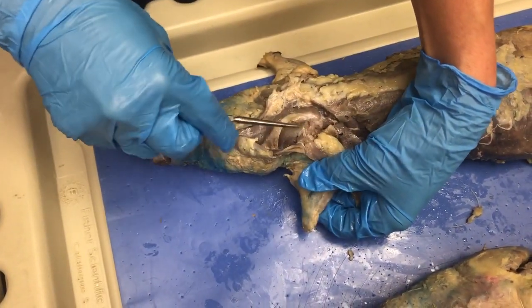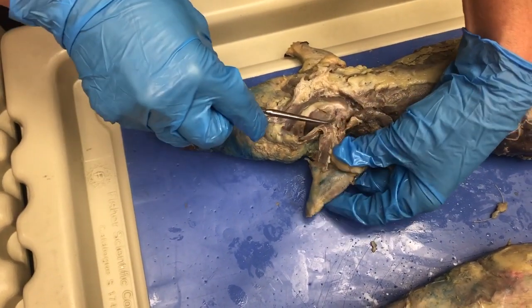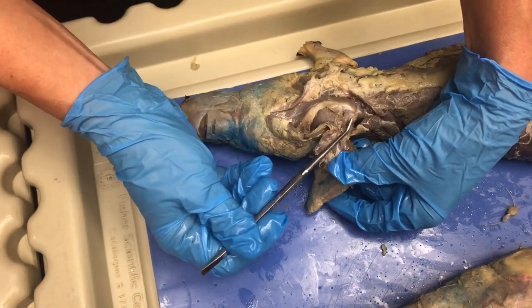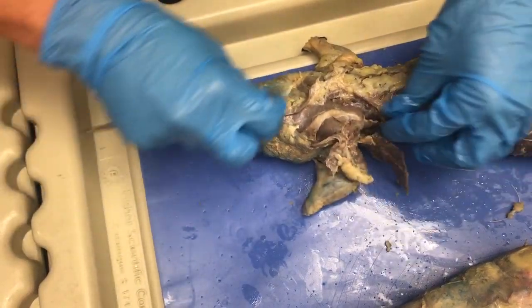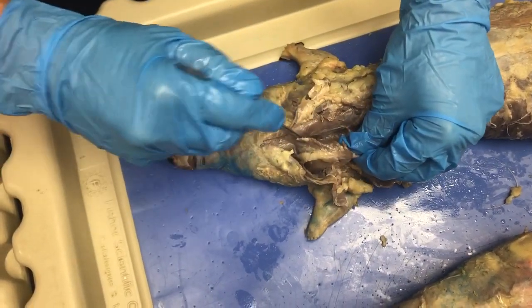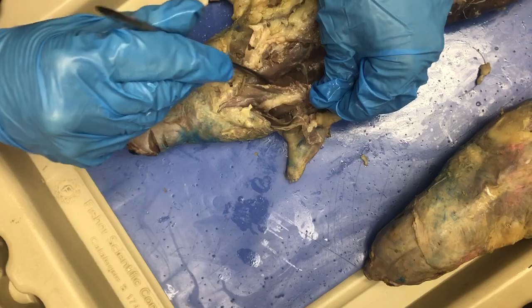The muscle above the spine of the scapula right here is the supraspinatus. The one below it is the infraspinatus. And then you have the muscle next to that which is the teres minor. And then under the scapula itself is the subscapularis.